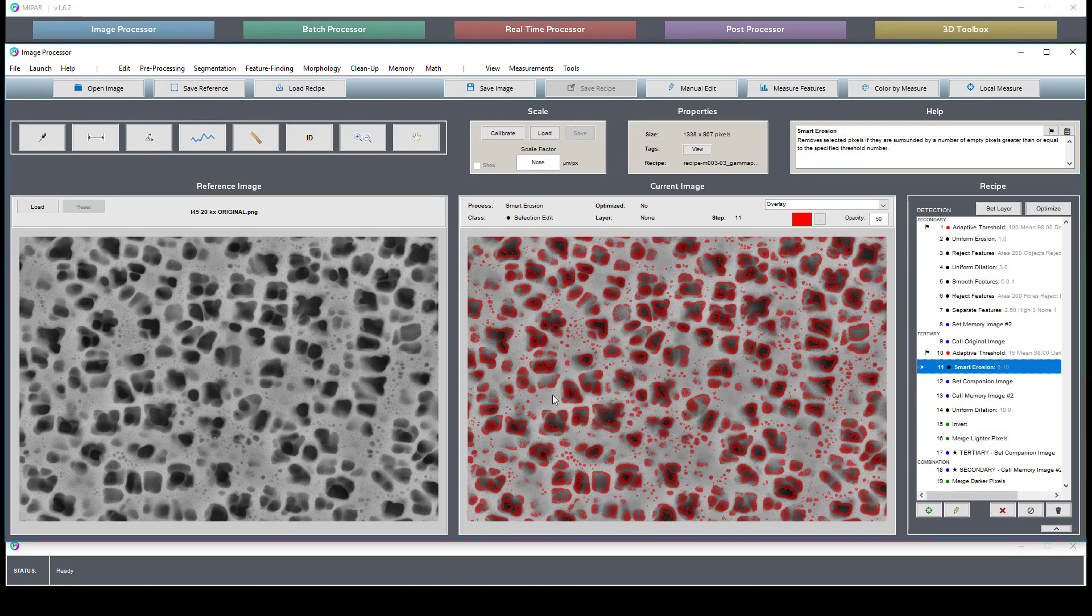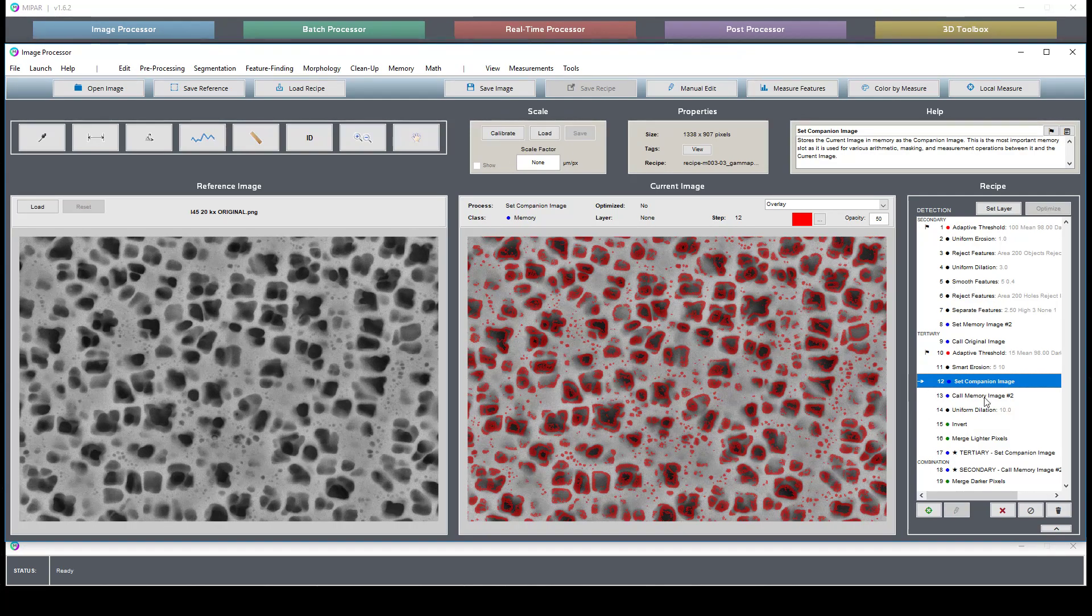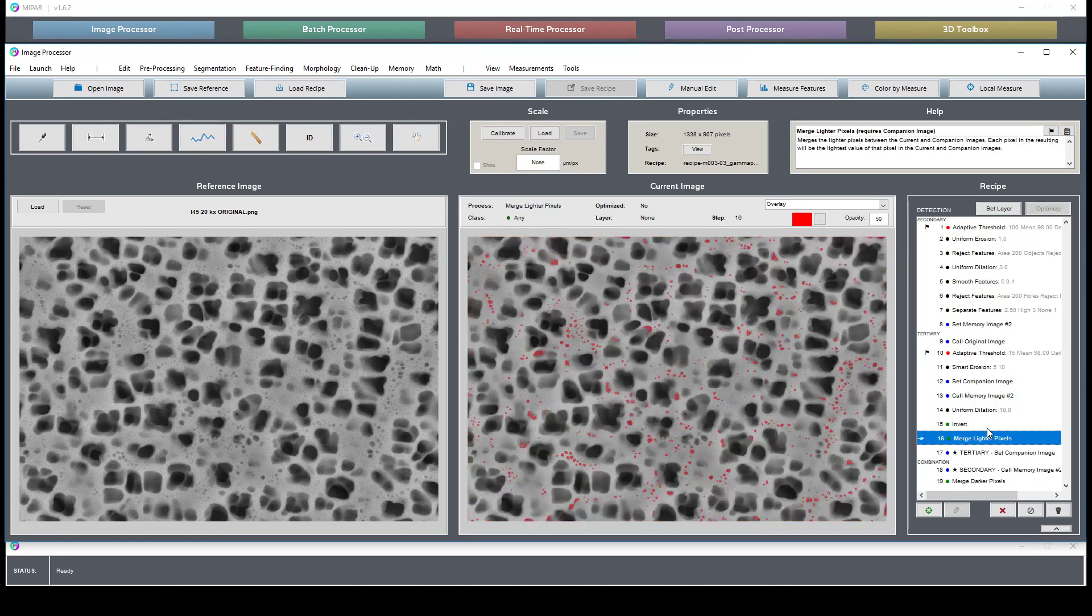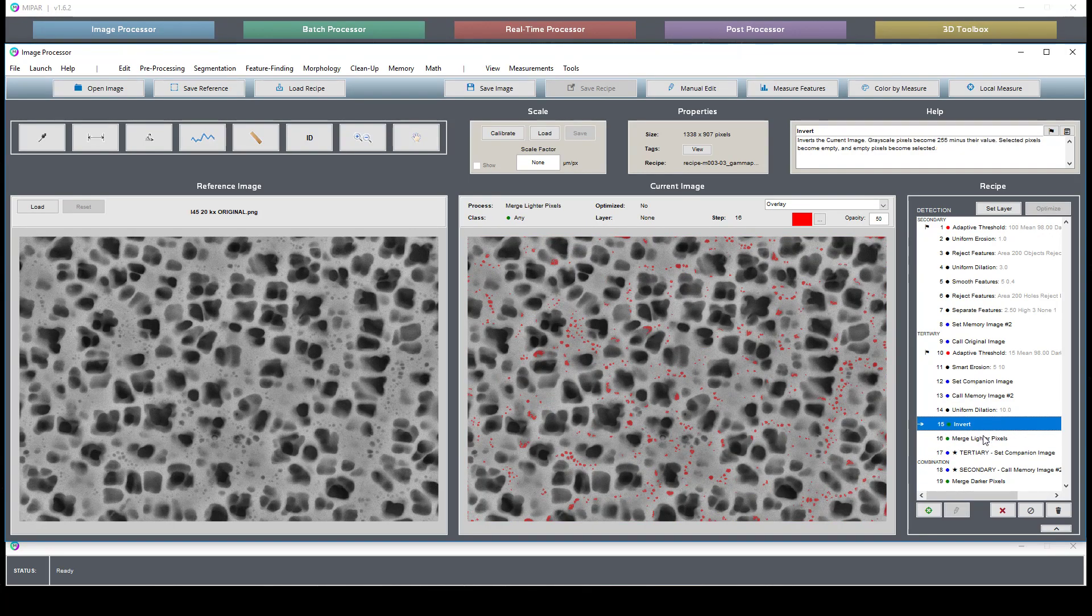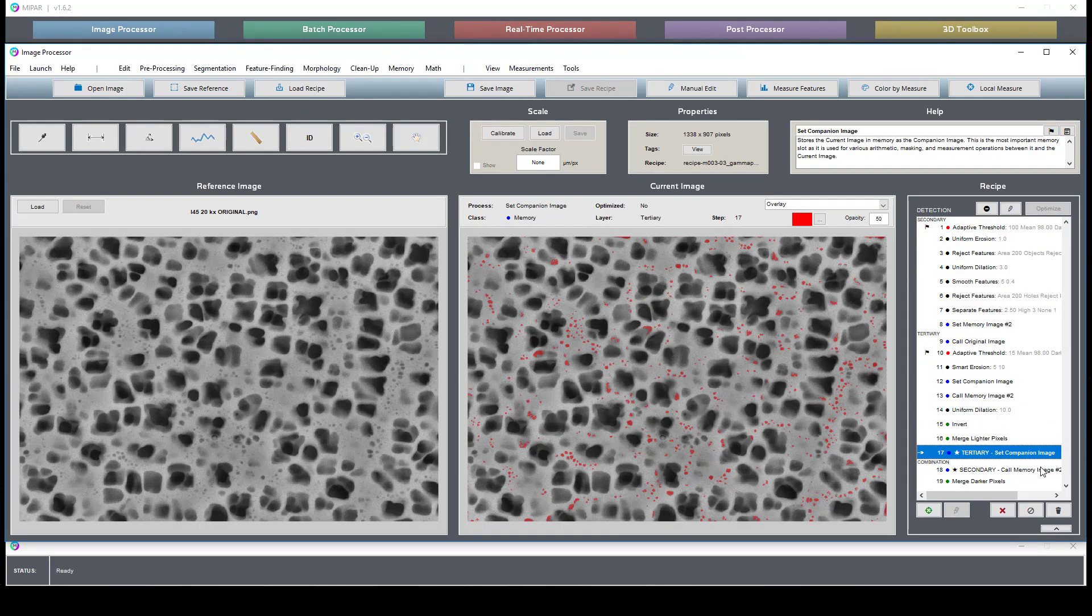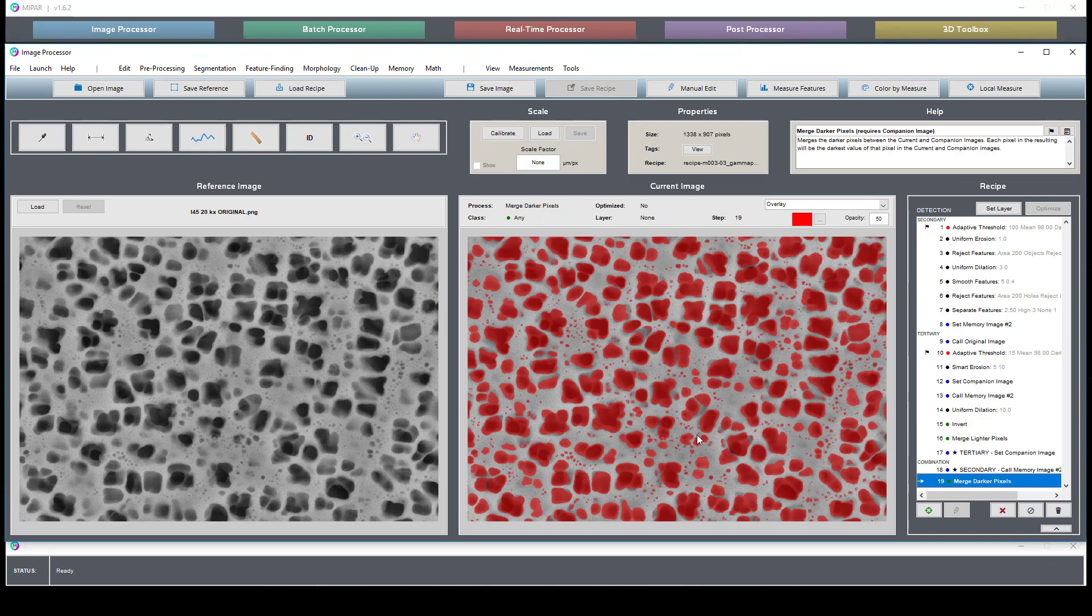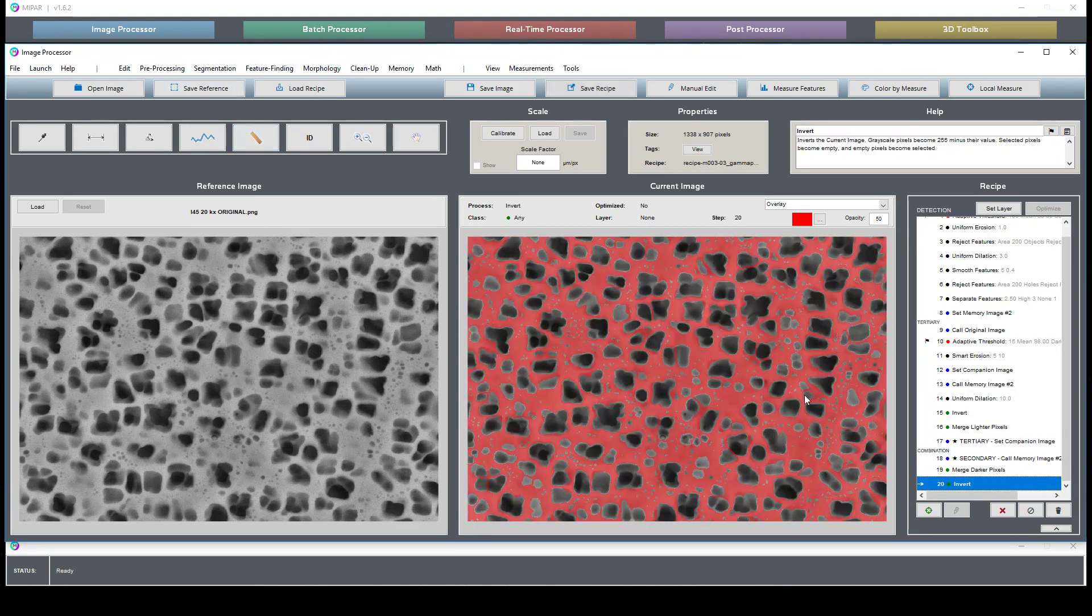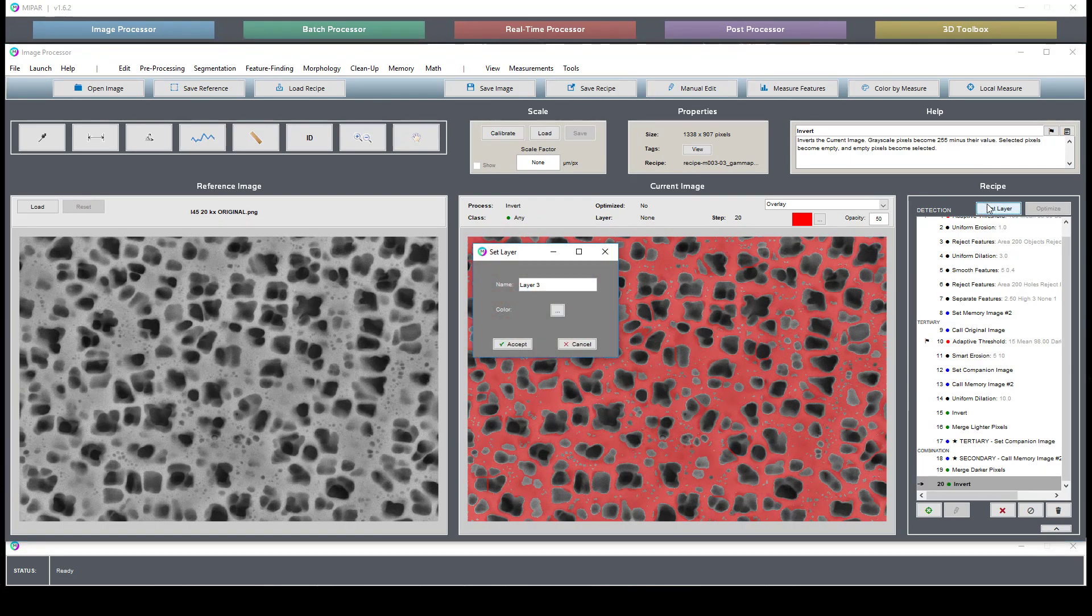We clean this up a little bit, call back our secondary, dilate, invert, and then do a feature intersection to give us the tertiary phase. Now we can call these back and combine them, and then if we set an invert, we can call this our matrix phase.